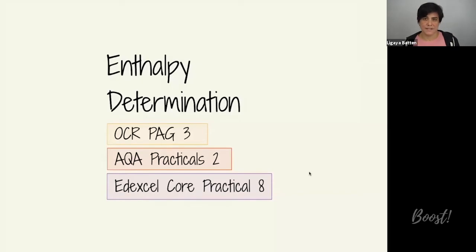If we have time at the end, we'll go through some example questions of how this might be questioned in the exam. But really today is about focusing on how the experiments are done and how or where issues may arise in the experiment. So in a second, I'm going to share my screen so that we can see some diagrams of the experiment itself, looking at how to set it up, and then also how to calculate the enthalpy change from the results in your experiment.